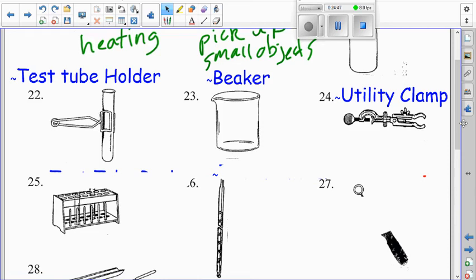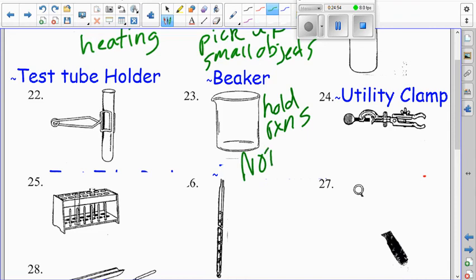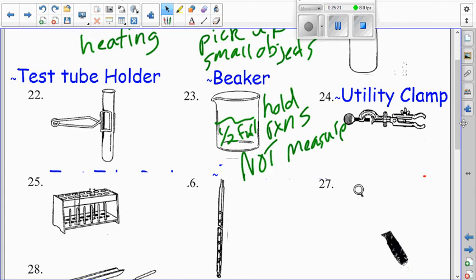A beaker can hold reactions, but not measure. Hold reactions but not measure, okay? So just like the Erlenmeyer flask, you should never measure with a beaker. Why does it have numbers, Mr. P? To let you know about how much it can hold, okay? And generally speaking, you don't want to make this more than half full. So you don't want to have a 400 milliliter beaker have more than about 200 milliliters of stuff in. If you have 210, that's not a big deal. It's just a rule of thumb, about halfway is the max.